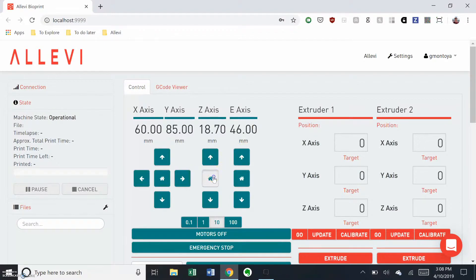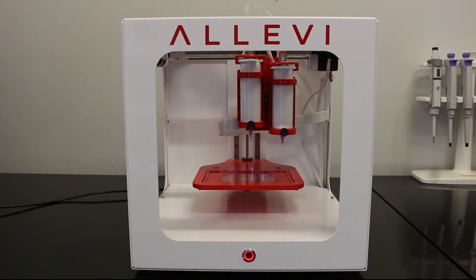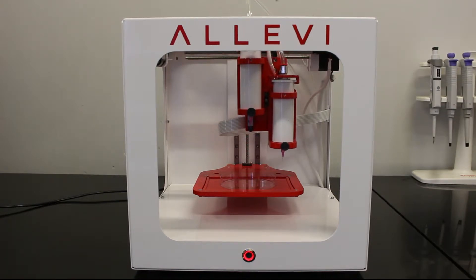In the Alevi software, home the z, e, and xy axes. This will lower the bed plate and bring the extruders to the front right of the printer.